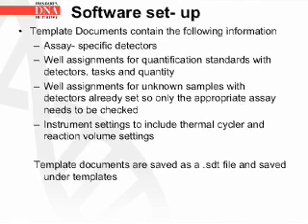Template documents contain the following information: assay-specific detectors; well assignments for quantification standards with detectors, tasks, and quantity already filled in; well assignments for unknown samples with detectors already set, so only the appropriate assay needs to be checked; and instrument settings to include thermal cycler and reaction volume settings. Template documents are saved as a .sdt file and saved under Templates.